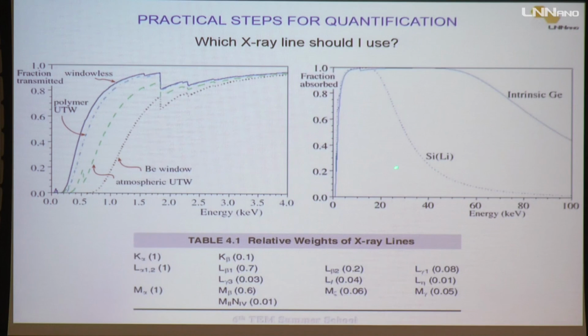You see that the silicon-lithium and the SDD run in a similar way. You have all the X-rays absorbed being measured just in a very small region here, from about 2 or 3 keV to 20 keV, okay? And then you can deal with this information just in this region of energy, okay?